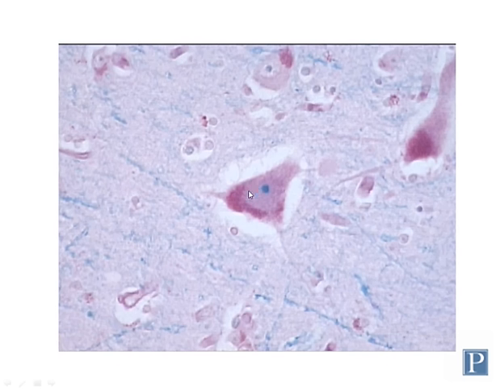If you look carefully, you can see that there are two different colorations in the cytoplasm in some of these neurons. So the cytoplasm is kind of granular and eosinophilic, as is typical for cell types, but there's also this deeper sort of magenta colored substance.